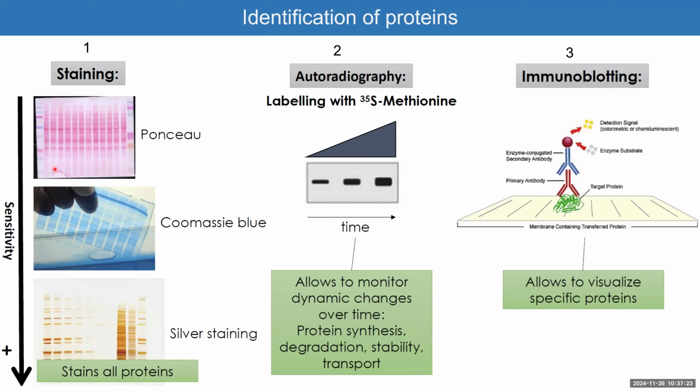Now, the second thing you can do is the Ponceau is not specific. So it's just showing the total amount of proteins, and it's unspecific to one type of proteins.